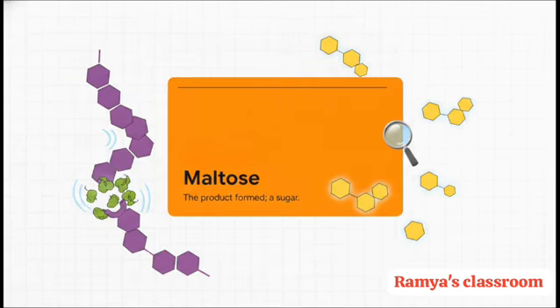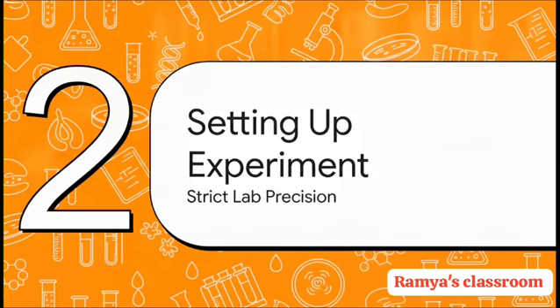And our third key term for today is maltose. Maltose is a type of sugar, and for us, it's the final product of this experiment. See, when our enzyme worker, that salivary amylase, gets a hold of the starch substrate, it goes right to work breaking it down. The finished, newly processed result of all that breakdown, that's maltose. All right, moving right along to section 2, setting up the experiment.